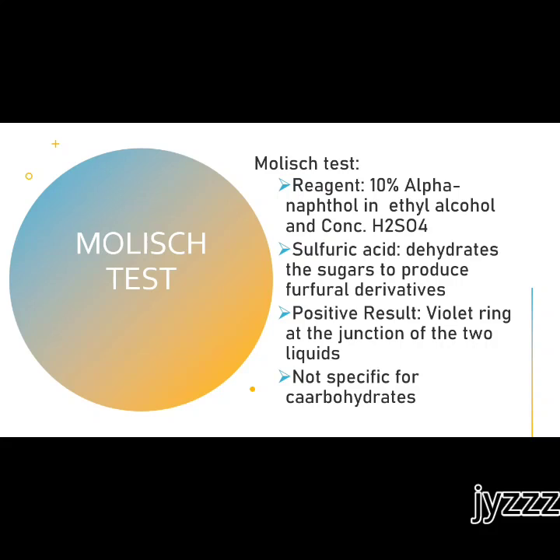Again, your pentoses will yield furfural, and your hexoses will produce hydroxymethyl furfural. And this one, of course, is not specific for your carbohydrates. For that, your sulfuric acid will dehydrate your sugar to produce furfural derivatives.